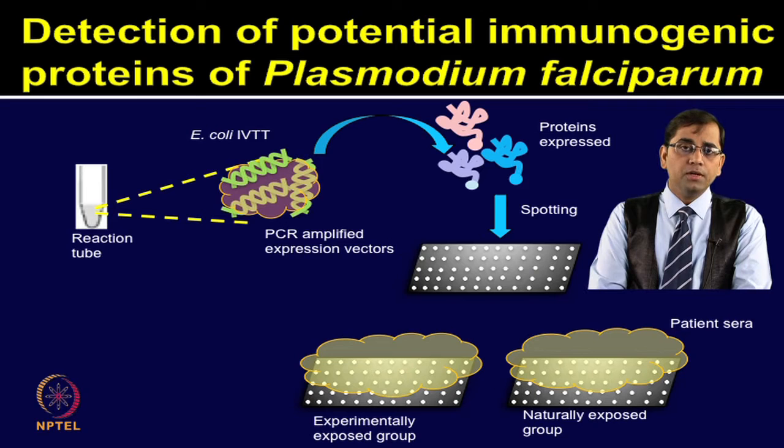and recombinational cloning procedures. After synthesizing the proteins from these 250 open reading frames, the authors profiled antibodies that developed after natural or experimental infection, or after vaccination with the attenuated organism. These individuals were exposed to Plasmodium falciparum either naturally or experimentally and were screened using protein microarrays. In this study, they identified 72 highly reactive Plasmodium falciparum antigens.